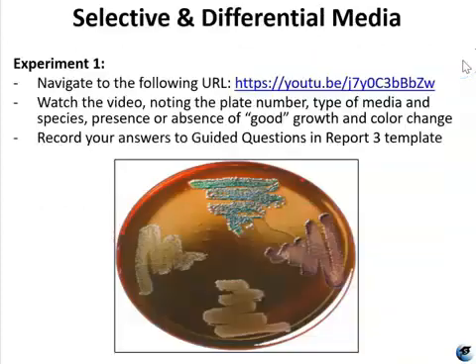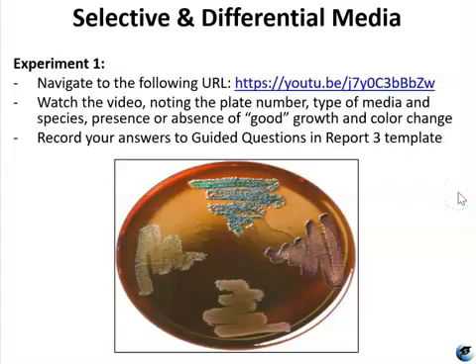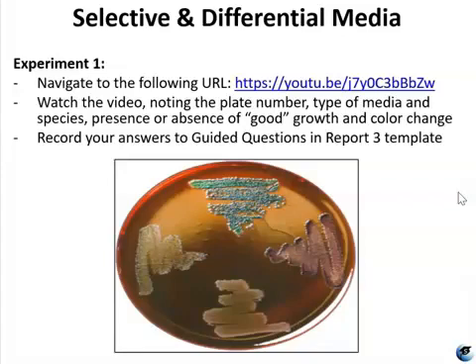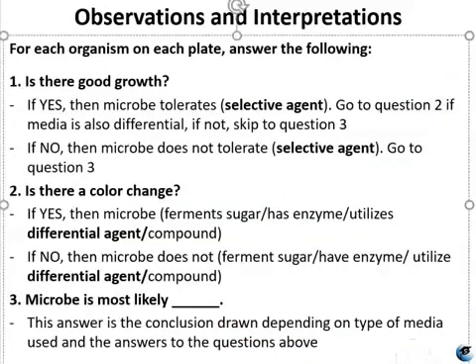For experiment one, you're going to be watching this video. There are several images of organisms that have been inoculated and incubated on selective or differential media, and your job is to interpret the results. Be sure to note the plate number, the type of media, whether the specimen showed good growth, and whether or not it showed color change if it is a differential media. You will use those observations to answer the questions in your report template.